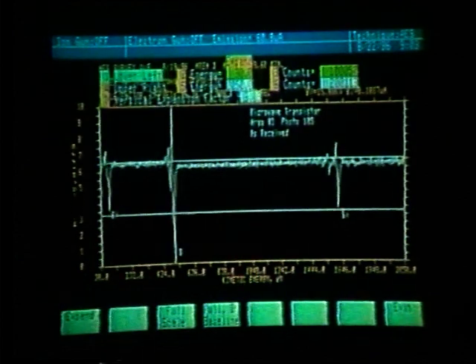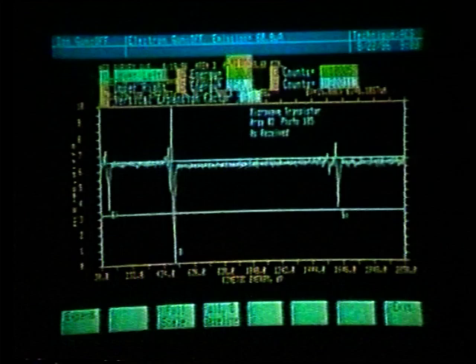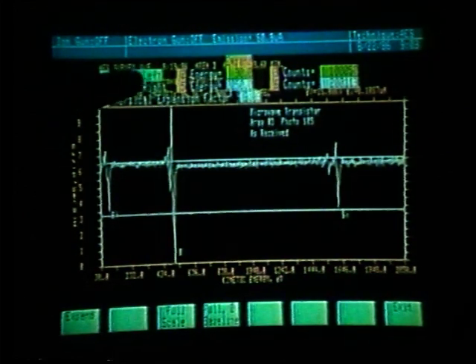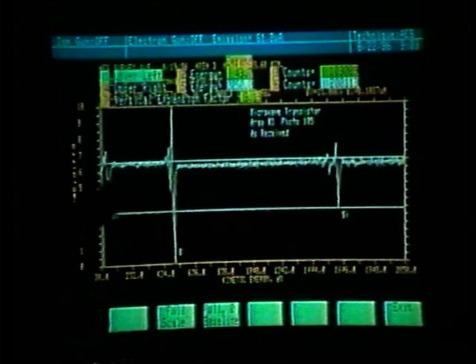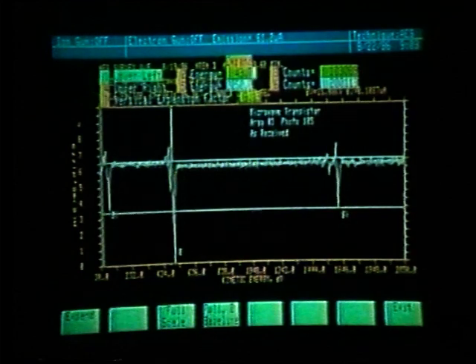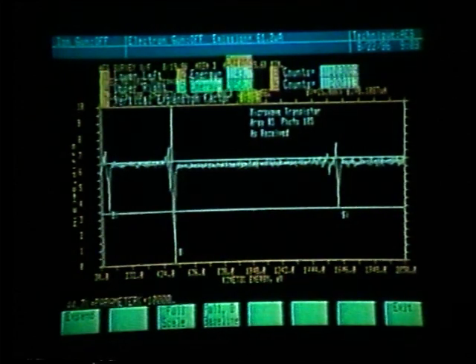What I would like to do is expand around the low energy silicon peak. To do that, I will leave function key number 1 so that we can move the lower and left portion of the rectangle, moving the lower up to the bottom of the peak, and the left portion we can move in just slightly. We now want to change the upper and the right, so I will press function key number 4.